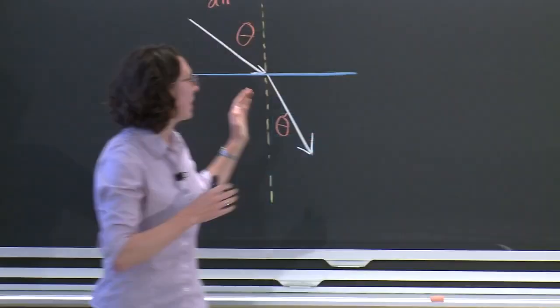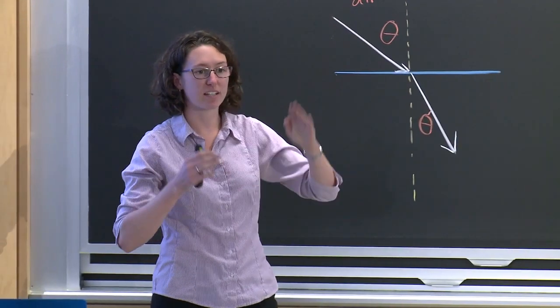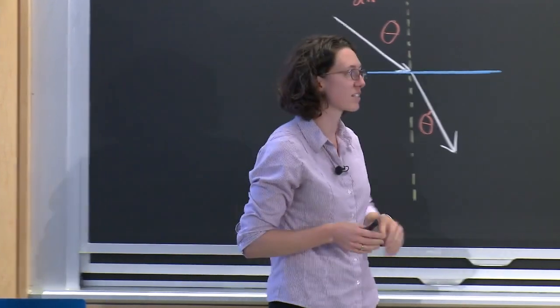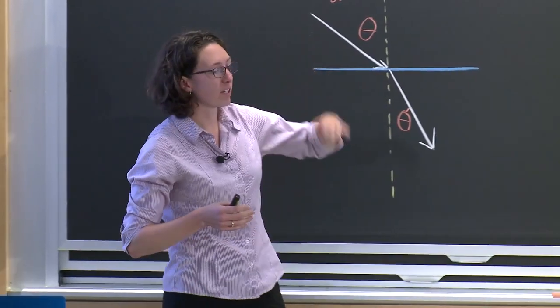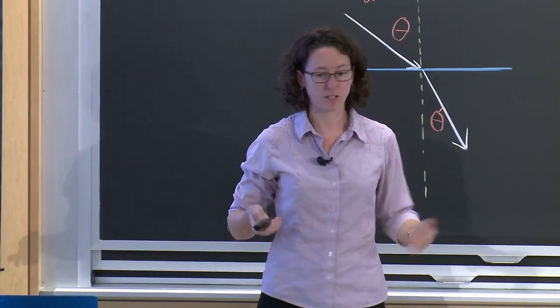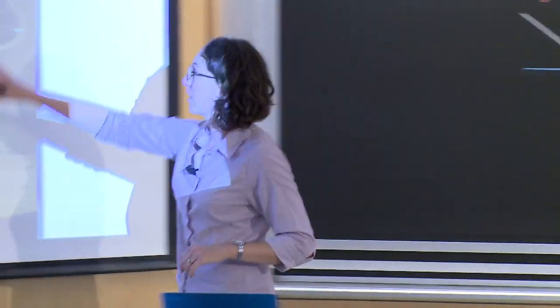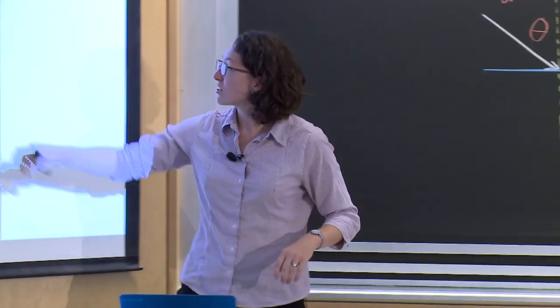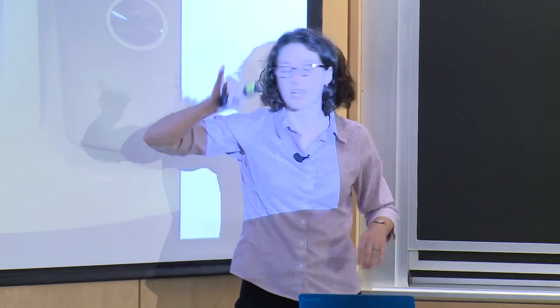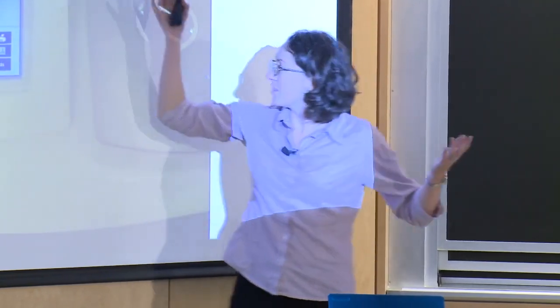So it'll change the angle of the incident light until it gets total internal reflectance, until it reaches the critical angle, if you remember from physics. And so once it figures out what the critical angle is, then it can figure out the refractive index of your sample, and so it'll tell you what the refractive index is right here. You don't even really have to do any math. And it'll also tell you what the temperature is, so you want to make sure that it's stabilized at 20 degrees before you actually take your measurement, and that's about it.